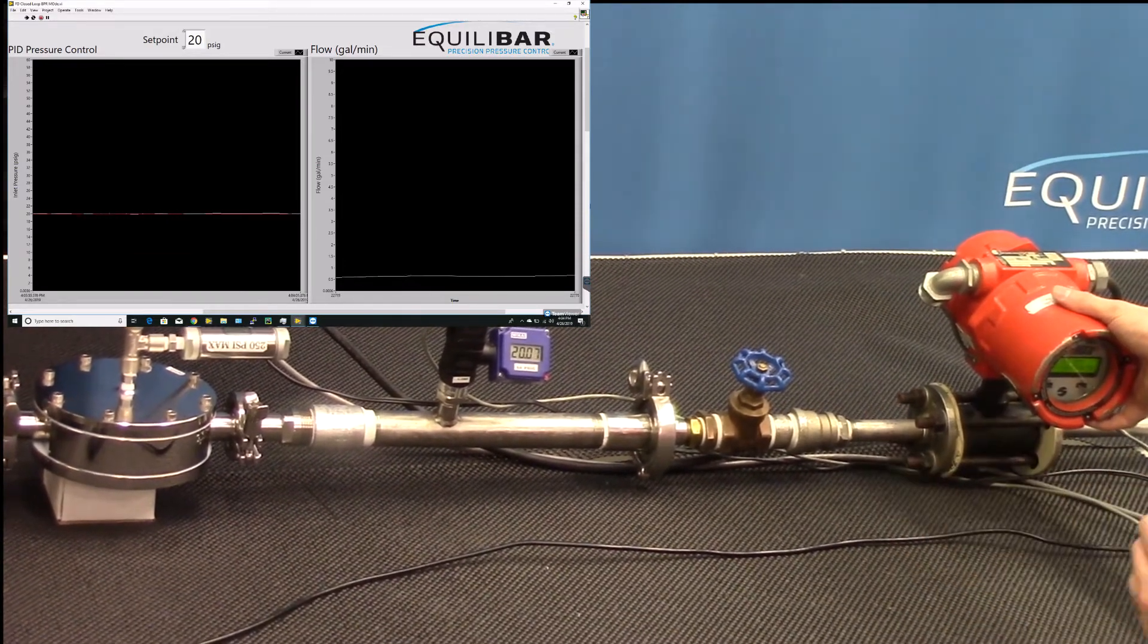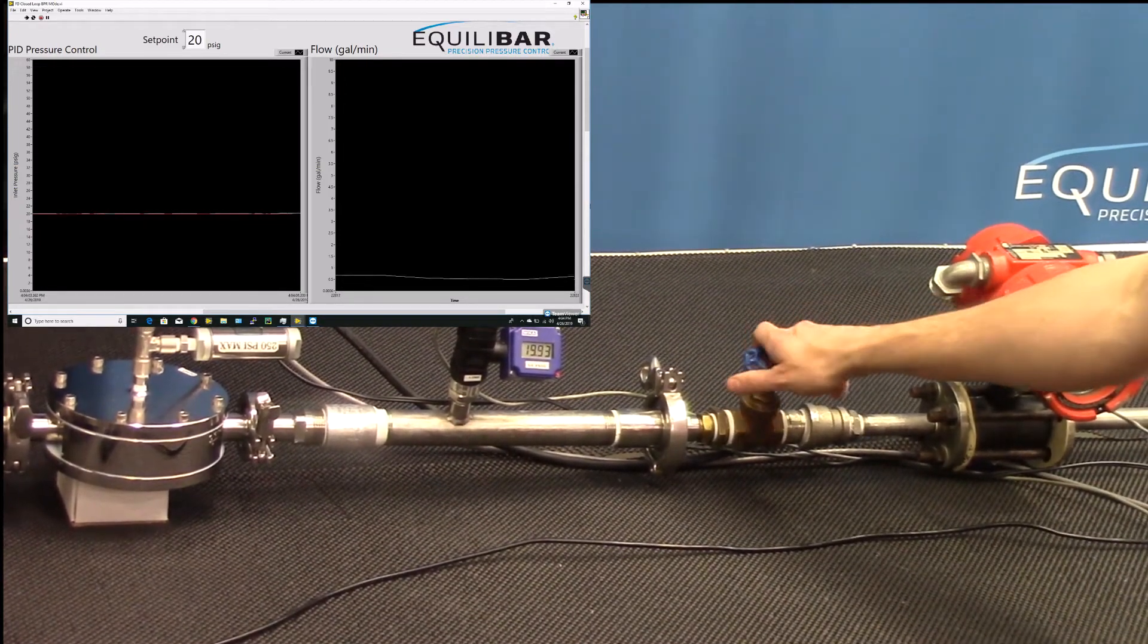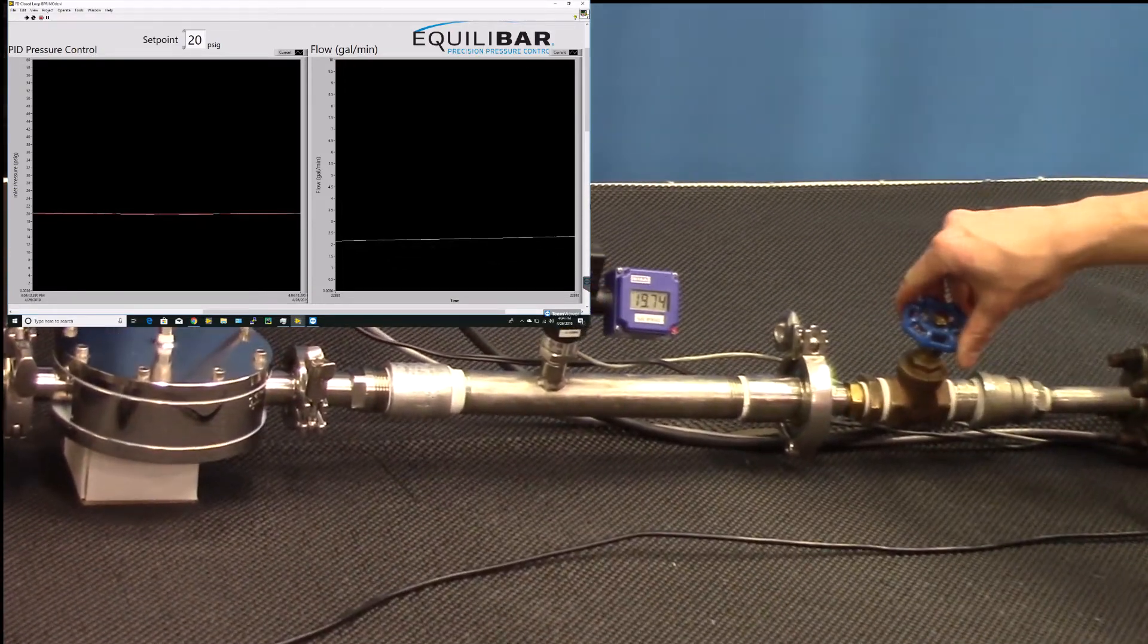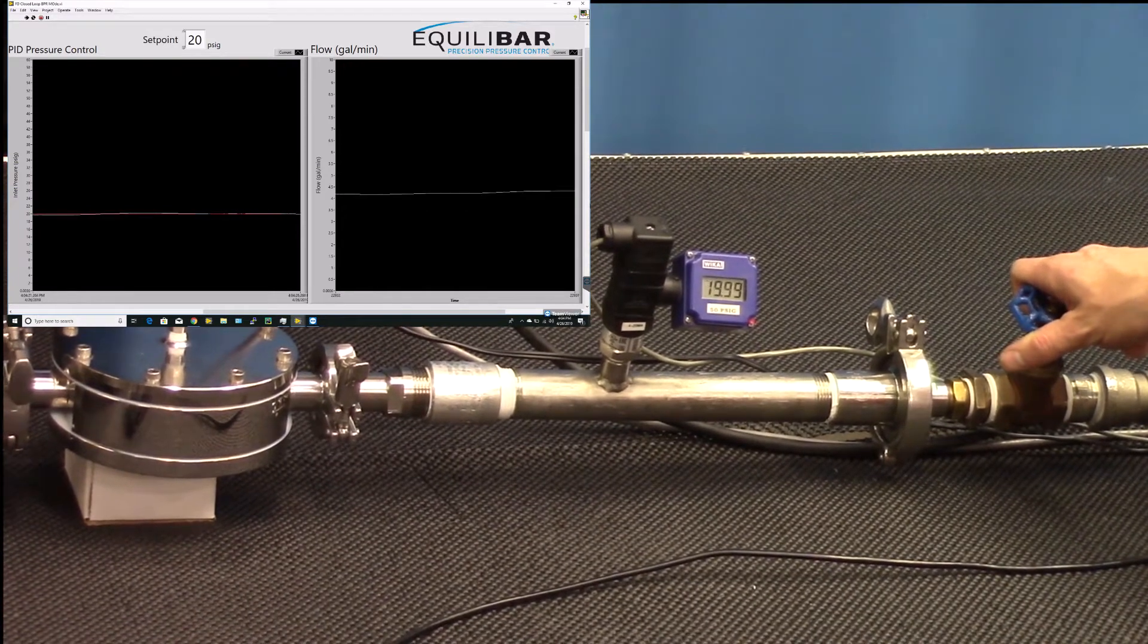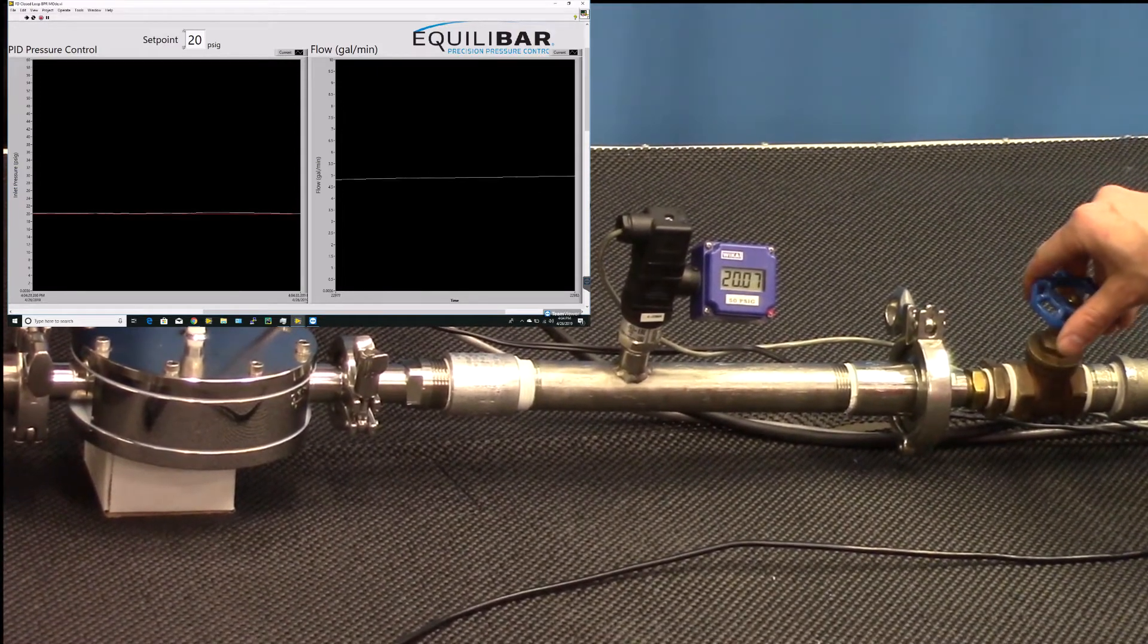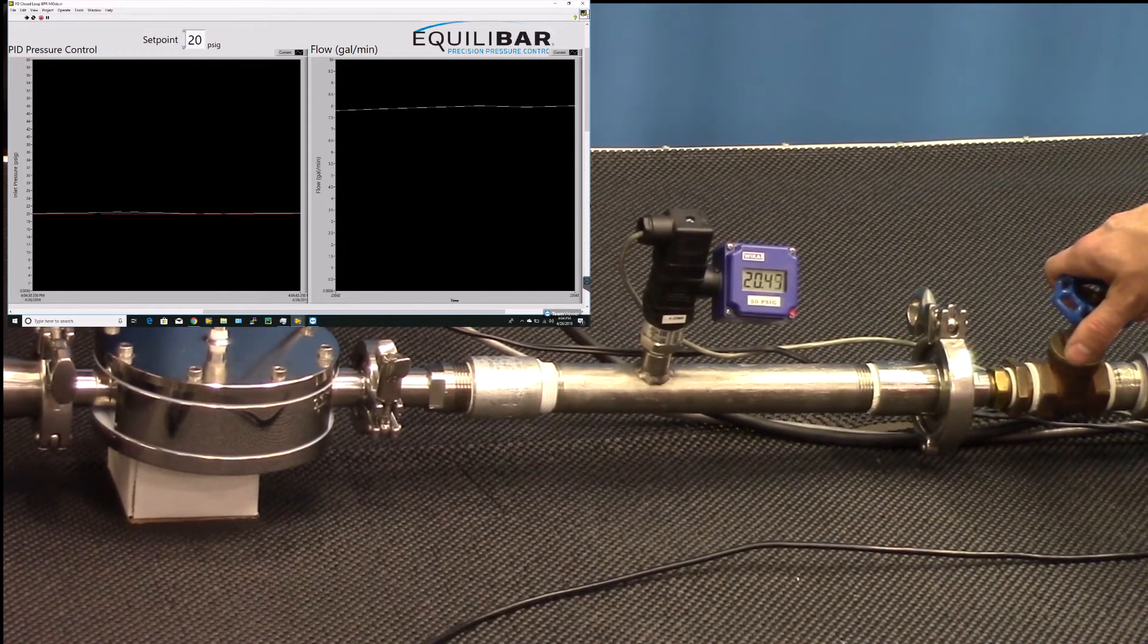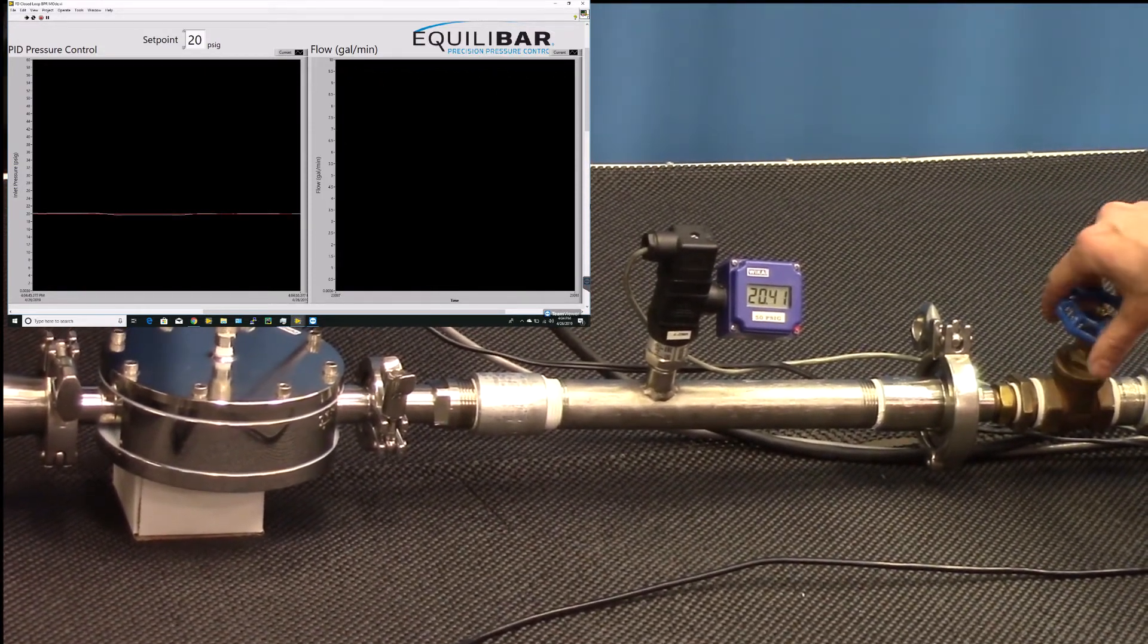We'll begin a little bit below that and go above up to 10 gallons, and again monitor inlet pressure and see what happens. I'm going to slowly increase flow again. We'll see the valve respond, holding pressure stable. Right now we're at five gallons a minute, so halfway through the range.